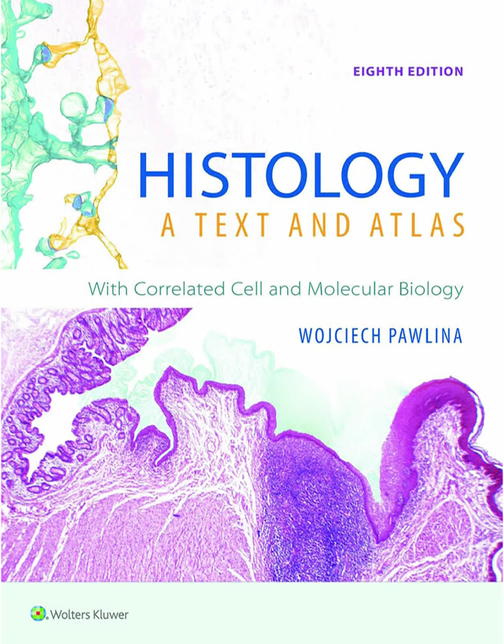Exactly. And then there's enzyme histochemistry itself. Here, the goal is to pinpoint where specific enzymes are active in the tissue. Usually, you don't stain the enzyme itself because there might not be much of it. Instead, you provide the enzyme with its substrate and capture or visualize the product of the reaction it catalyzes, right where it happens. So you see where the enzyme works, not where it is. Often, yes. For example, you can detect acid hydrolases, which are typical of lysosomes, or ATPase activity in cell membranes, which tells you about active transport. It gives functional information.